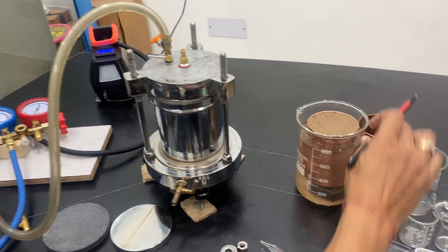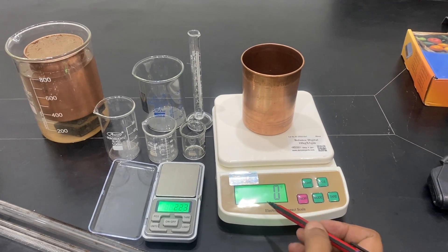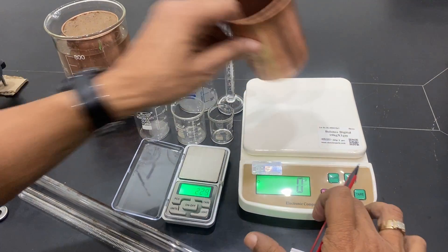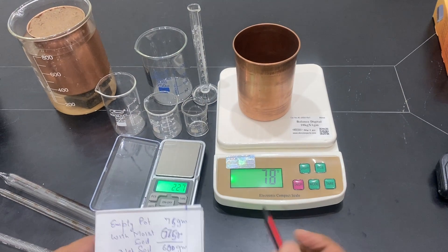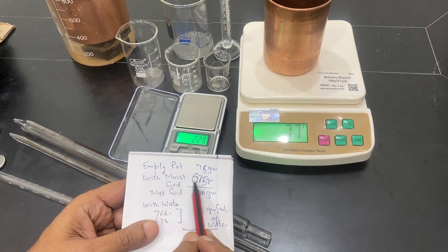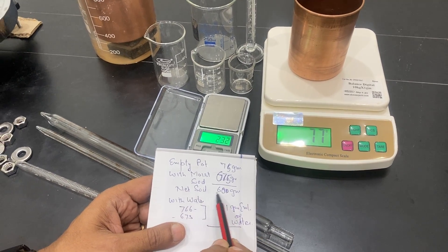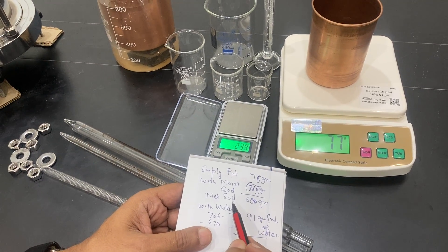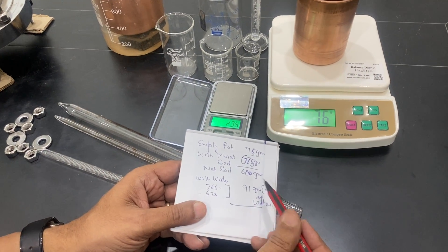I have taken a soil sample — this is the chamber I am using. I have calculated this based on two papers. This is a 75–78 gram empty pot, and with moist soil from the garden it became 675 grams, so approximately 600 grams of soil is there. You can use soil after drying it in an oven, but I am not using it dry for this experiment.